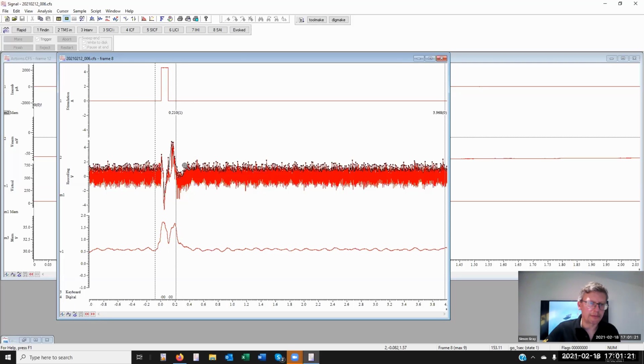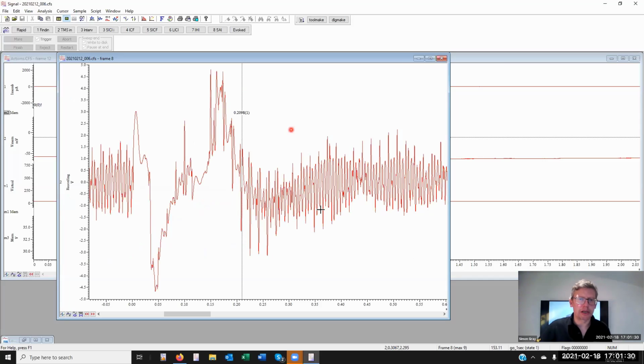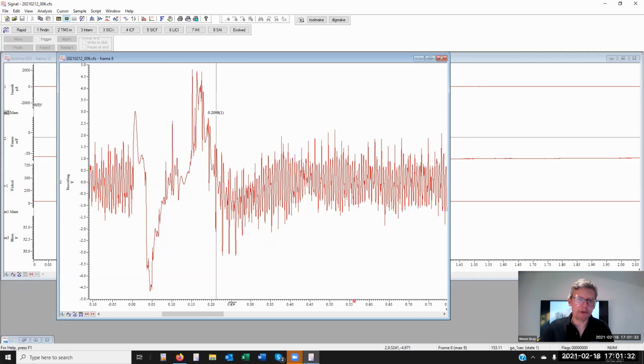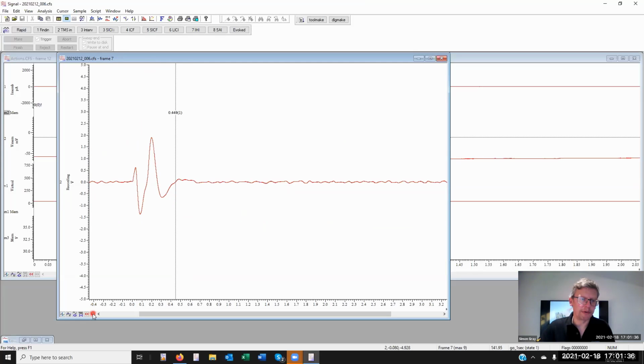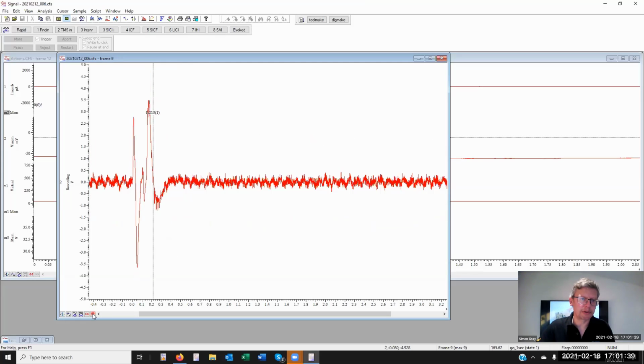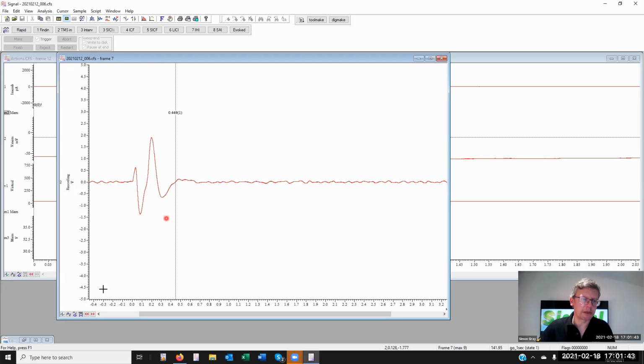Right. So we have here rather noisy data. I'm going to separate M1, which is finding all the peaks, and look at this channel only. Now comparing this channel or this frame with the previous one, so this is rather nice and clean.